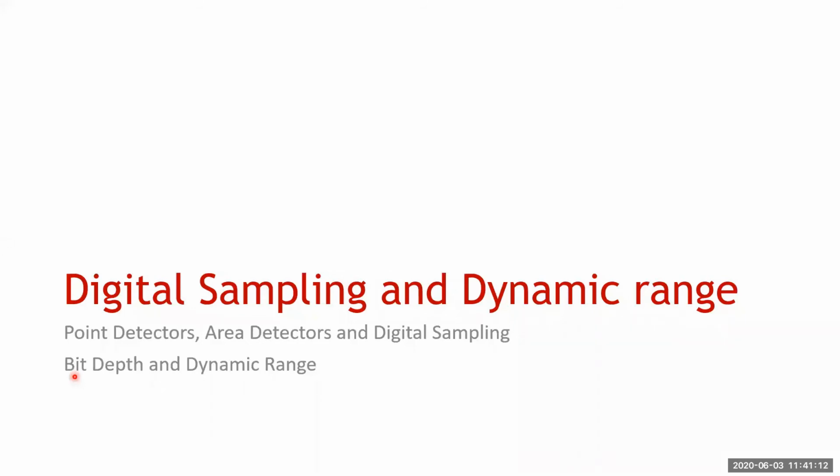So yeah, everybody knows how to pick a good objective in terms of numerical aperture or field of view, which cover slip to use, how the objectives are corrected for color, for planarity, their working distance, how the wavelength affects the resolution, what is Nyquist. You guys all good? I guess so. All right. Okay, so we'll start off with digital sampling.